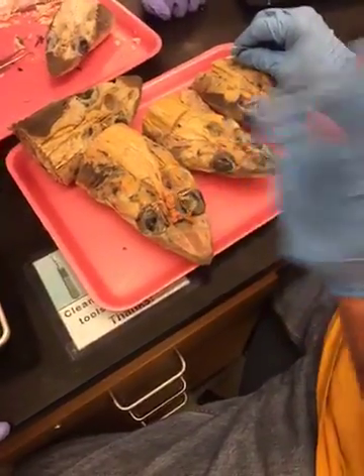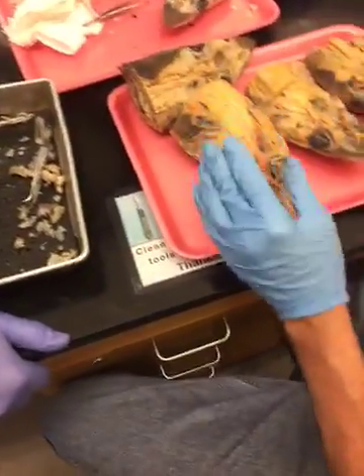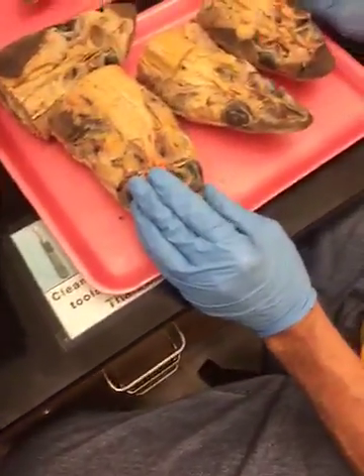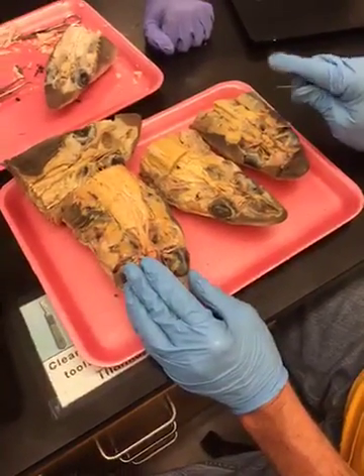Trigeminal has 4 branches, facial has 3. Yep, good, nice and clean. In 2 cases, their branches run together, so we'll start with them.